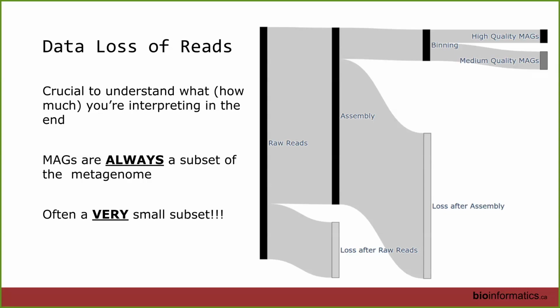Like, in that example, then you're going to get more MAGs? Maybe, I was saying maybe. It really does depend on your environment. Often the limitation to getting quality MAGs is it's more complicated than just sequencing more. Absolutely, if you sequence more, you have a higher probability.